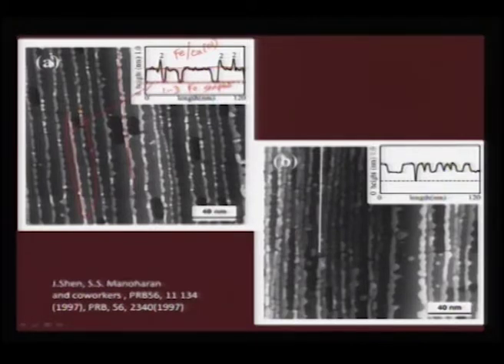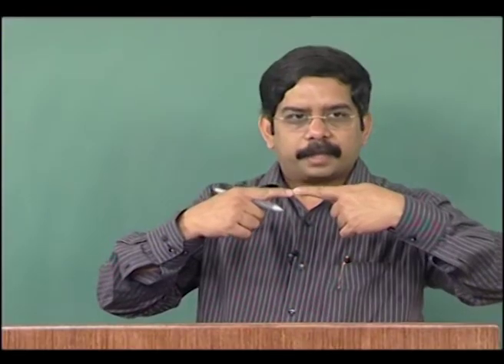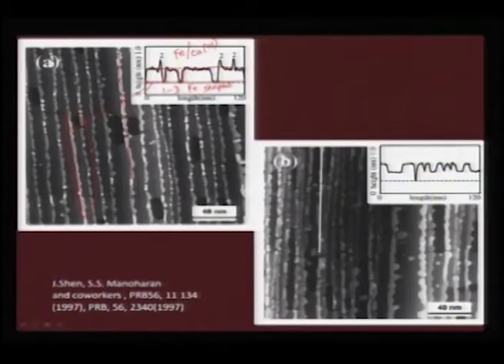and these troughs mean that between two iron islands there is a break, which means the iron atoms are not actually fused together, there is a discontinuity. So, I cannot call this as a iron stripe, but it is a one dimensional wire, but with discontinuity. So, if I keep on depositing, then this sort of troughs will be missing.